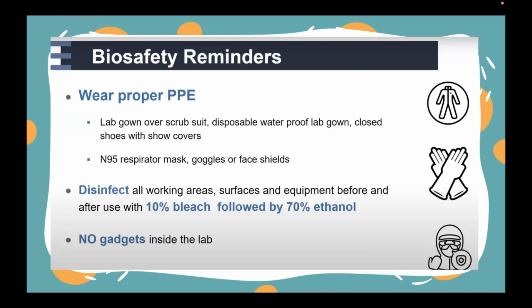So goggles or face shields, kailangan din po natin yan para ma-avoid yung mga talsik. Next, papasok na yung principles natin ng ating good laboratory practices which can be applied to different sections of the laboratory. Disinfect all working areas, surfaces, and equipment before and after use with 10% bleach and followed by 70% ethanol. Next, no gadgets inside the laboratory.